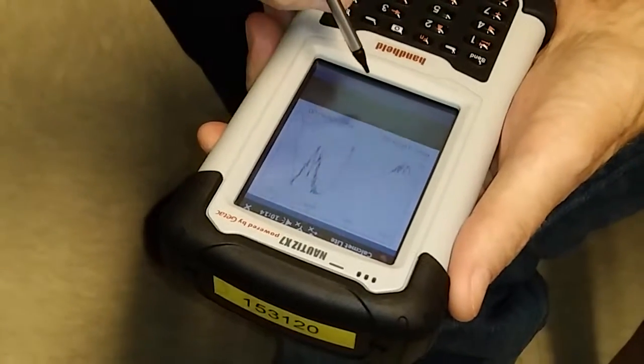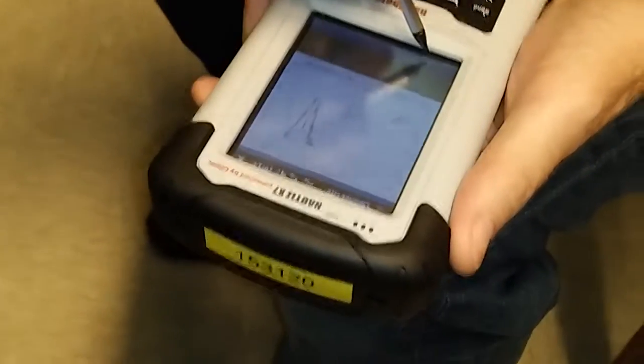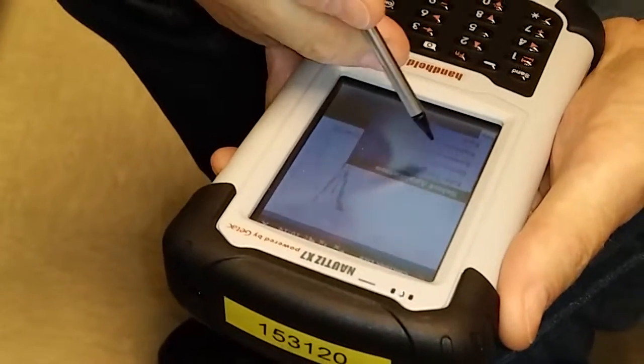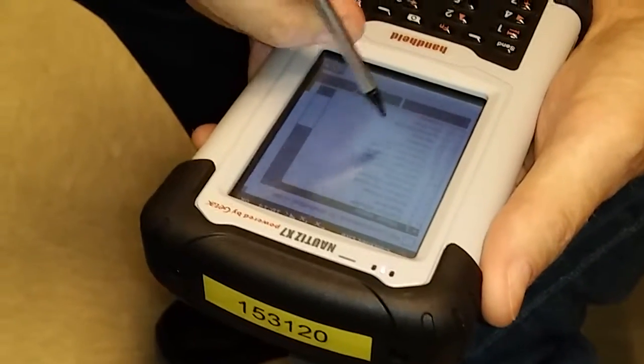Okay. Now settings, autosave, measure. Okay, we have the single, the hardware status, and then we have the file. But again, it's not a continuous measurement. Edit application.